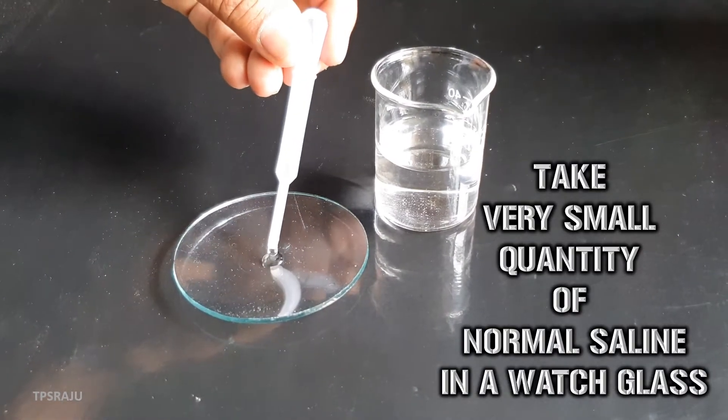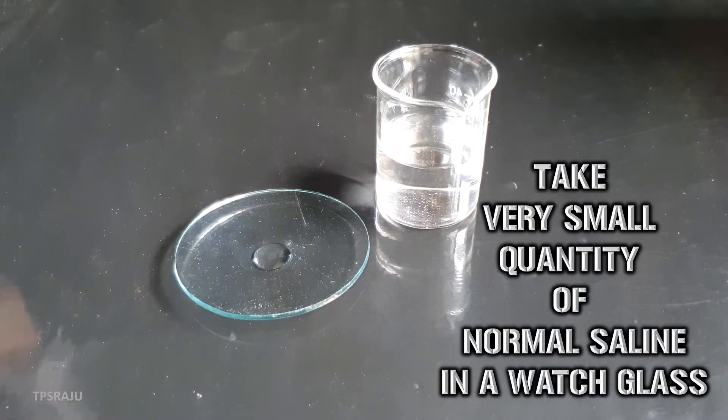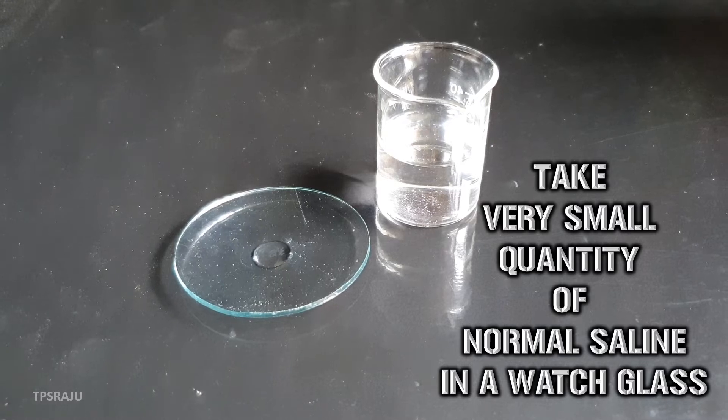First, we have to take a very small quantity of normal saline in a watch glass. Saline means salt water.